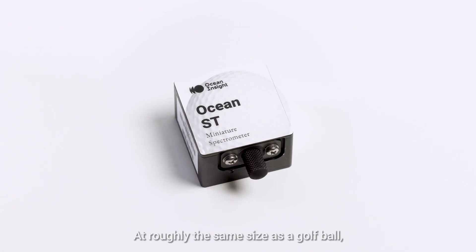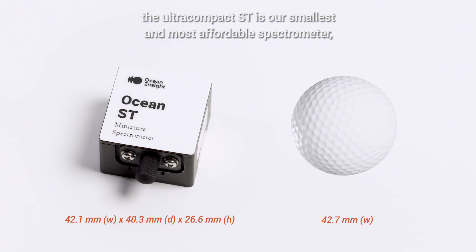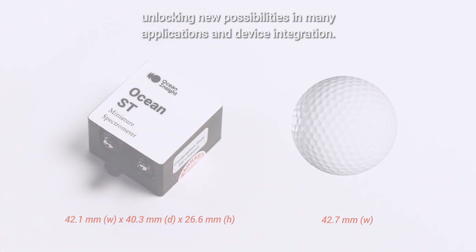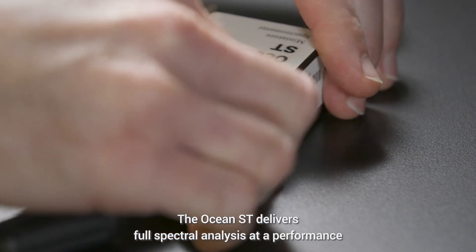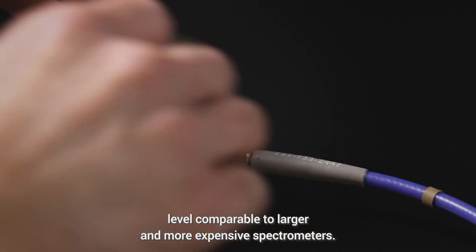At roughly the same size as a golf ball, the ultracompact ST is our smallest and most affordable spectrometer, unlocking new possibilities in many applications and device integration. Don't let the small footprint fool you — the OceanST delivers full spectral analysis at a performance level comparable to larger and more expensive spectrometers.